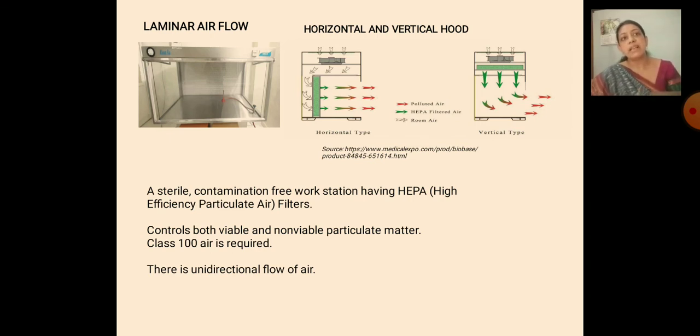Whenever you use a laminar airflow, remember to keep it clean. After the work and before the work, please clean with 70% isopropyl alcohol. After the alcohol dries up, only then start the Bunsen burner. Otherwise, the alcohol being inflammable, it may catch fire. So it is very necessary that we take precautions and safety measures, and check that contamination does not spread either way when we are working in the microbiology lab.